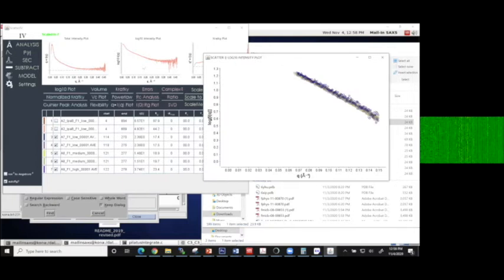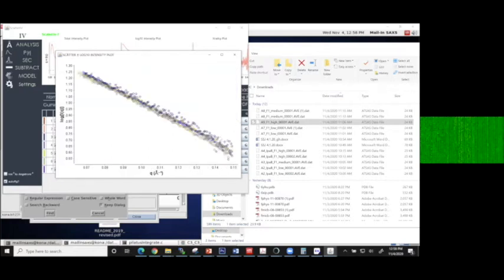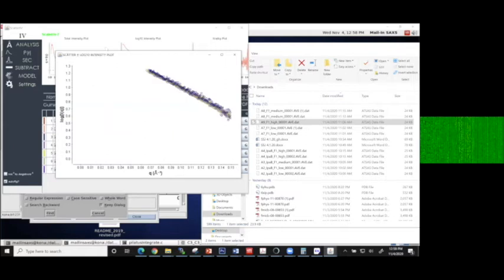Okay, and with Scatter, you can zoom in and out. The way you do that is by dragging one corner, holding down your mouse and zooming, just like you do with other functions. But to zoom out, and this is something that Rob, who created this program, didn't describe very well, you hold down the left button and just flick. So I'm going to go here, and that's the example, and then you can flick out to unzoom. So you don't have to replot it every time.